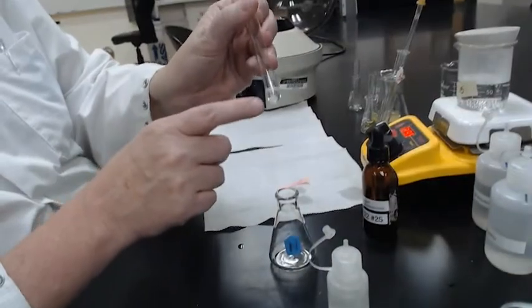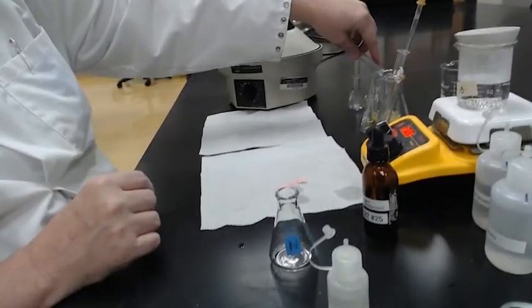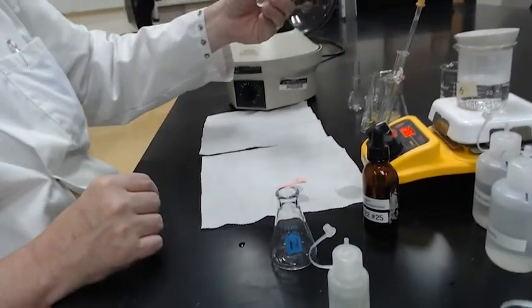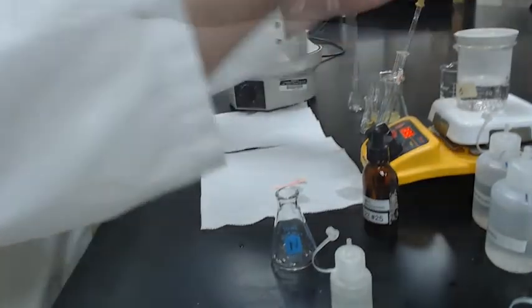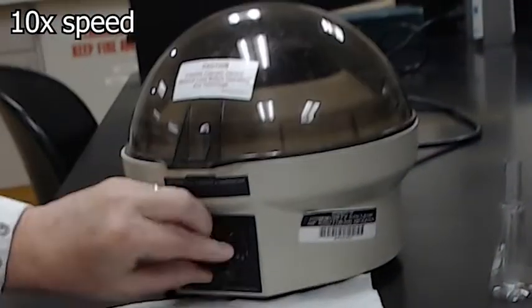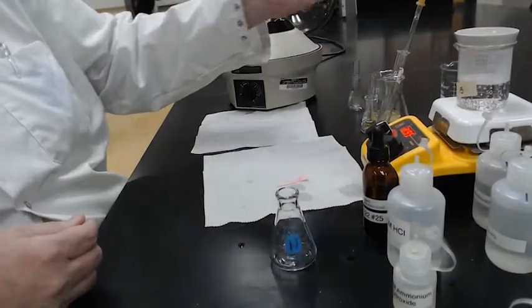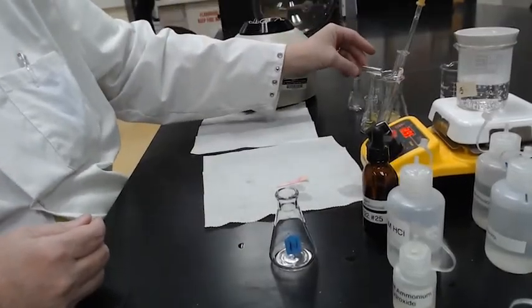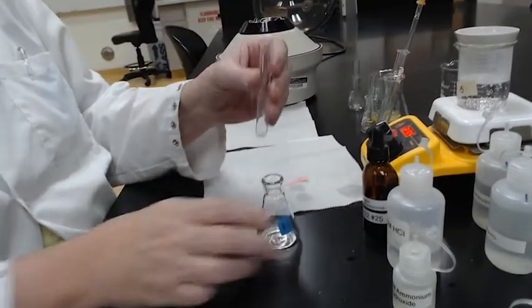All right, we definitely have a precipitate. We're going to decant off the liquid. We need to save only the solid. And we're going to do one water wash, and I'm going to borrow my hot water bath this time because I put pure water in here. All right, decant the liquid. And now we're going to test for magnesium with what's left here.